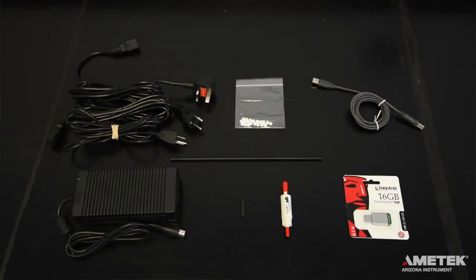If you have purchased the J405 with the communications package, you will also receive a six-foot type A to B USB cable as well as a USB flash drive. If you are missing any of these items or have questions about these or any other parts and accessories you may have received, please contact Ametek Arizona Instrument or your local representative for assistance.